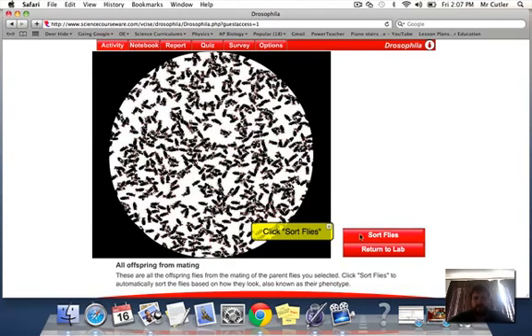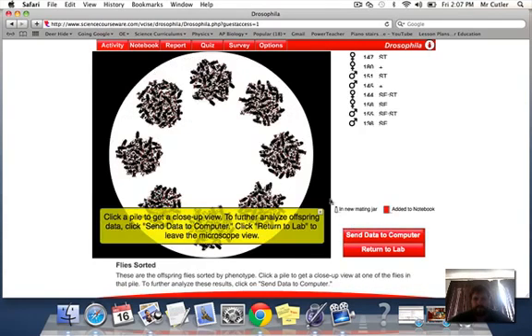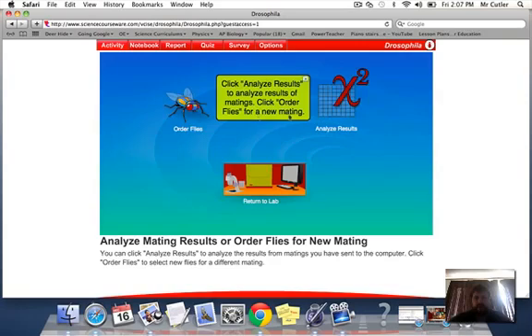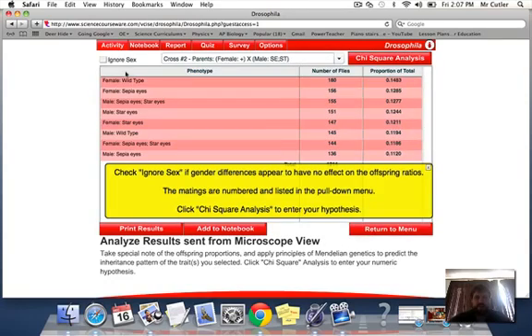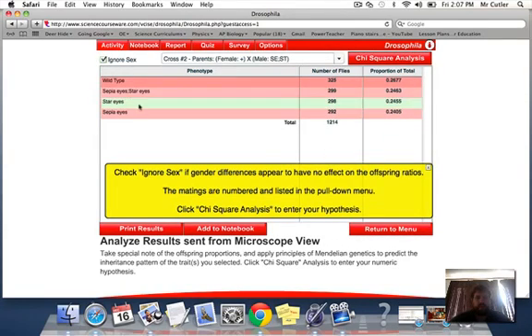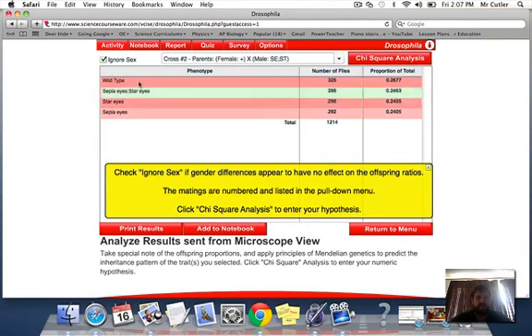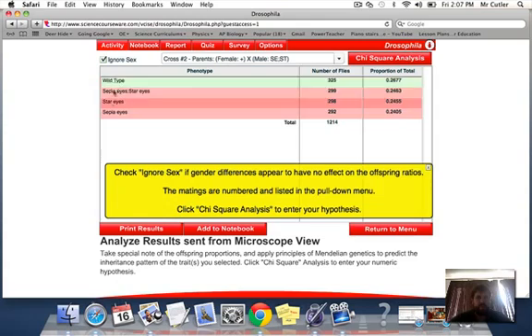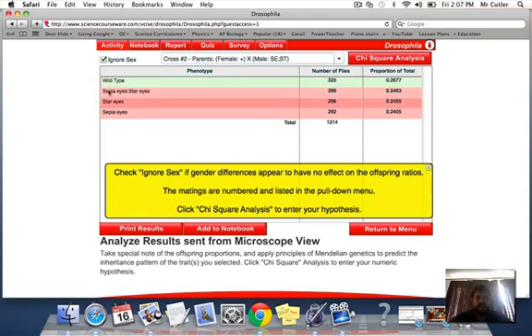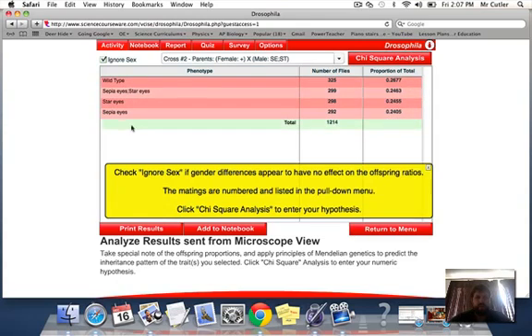Let's sort the flies out. And yeah, as it turns out, if I take this data, send it to my computer, I will once again ignore sex because I'm not worried about whether males or females have it. Neither of them appeared to be sex-linked traits. They both appear to be autosomal traits.